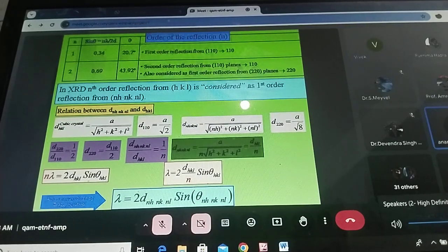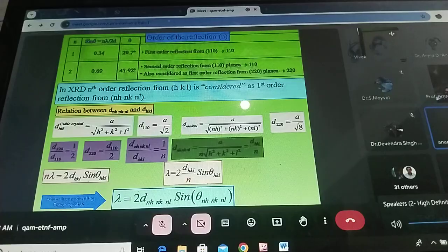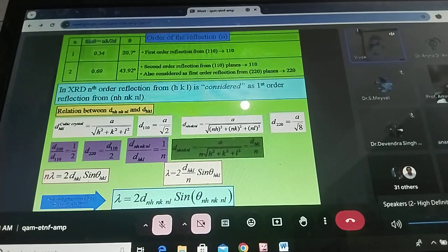Sir, my question is not that. My question is that the overall compound is neutral, and whatever density I will get, the atomic scattering factor of titanium or iron, whichever you are talking about, are different. Yes. I have to feed the formula whenever I have to solve.